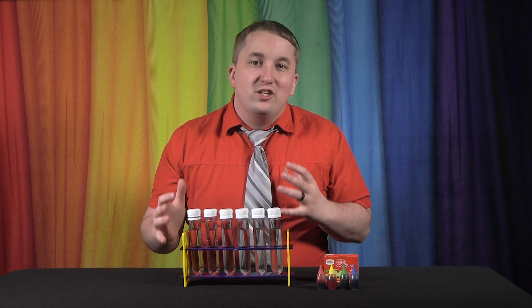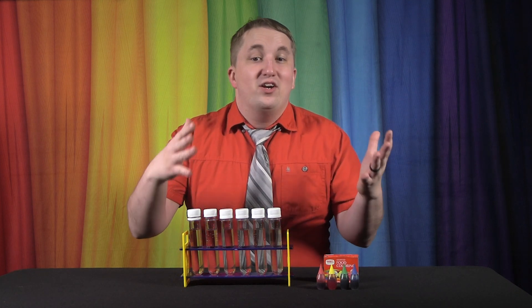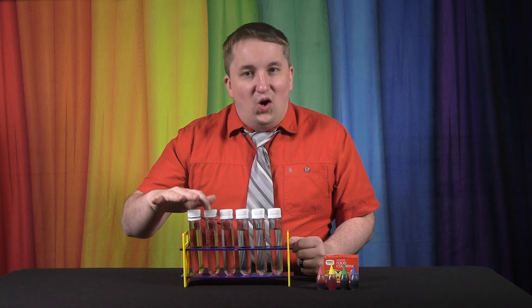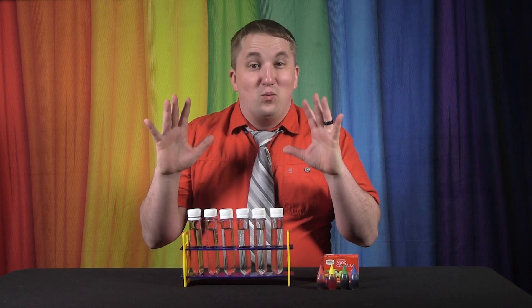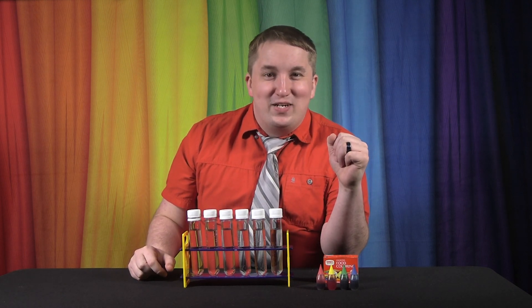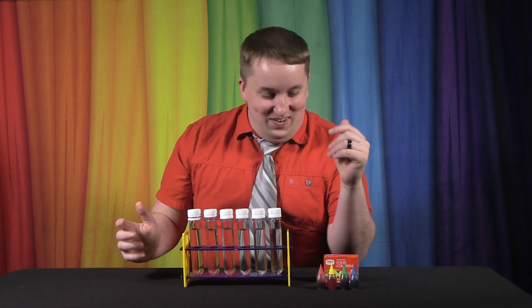First up, we're going to decide which test tubes are for which colors. They're going to go in order on screen: red, orange, yellow, green, blue, and purple. That's what we're hoping for with this experiment — and this is an experiment we've never tried before, so we hope it works out.